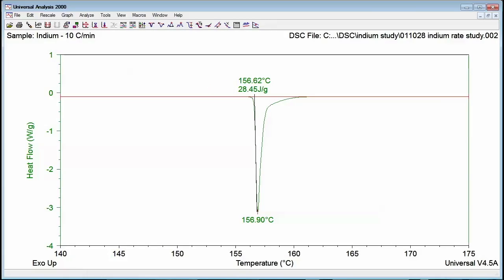Your own laboratory standard operating procedure should determine your error tolerance and when you need to recalibrate. For example, you might determine if the measured value is more than 3% in error, then recalibration is required. As enthalpy is strongly dependent on the measured mass of the sample, TA Instruments generally does not provide a calorimetric accuracy specification. This same data can be used to verify the temperature accuracy.